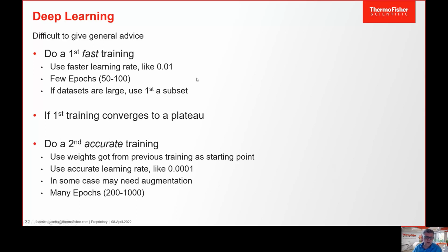It usually takes a lot of time and a lot of resources, so you need a specialized machine to do that. You need a machine with a good GPU. The RAM is not really an important factor. What's important is the GPU, because everything happens on the GPU. The bigger the GPU memory you have, the better, because this is going to be a bottleneck. We typically say you need at least 8 GB on a real data set in the GPU memory, but if you have more, it's better.